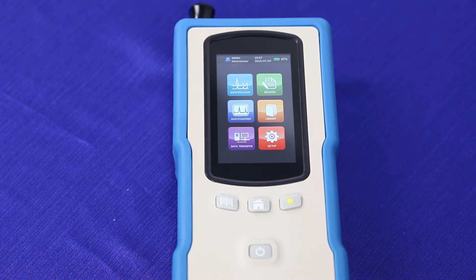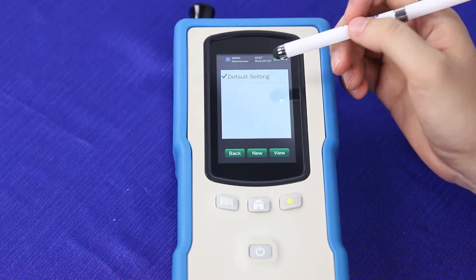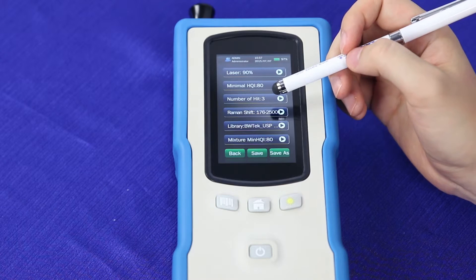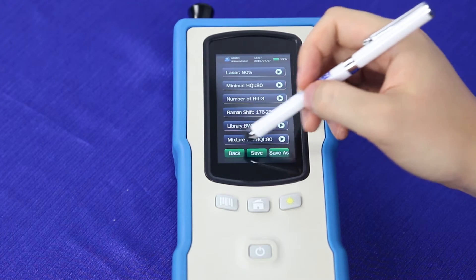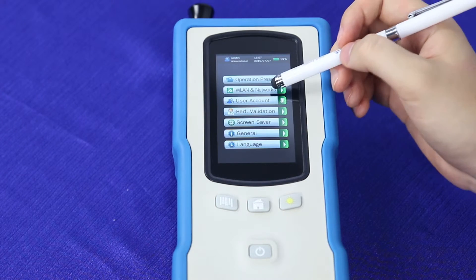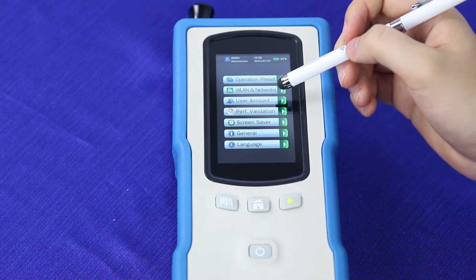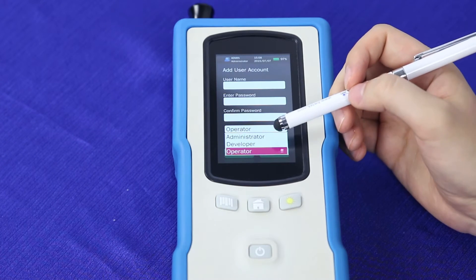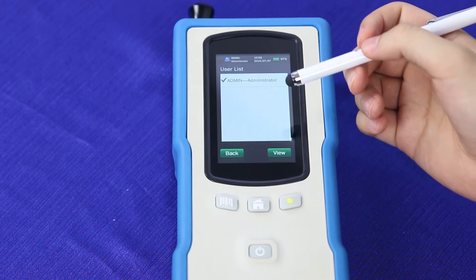Since you've logged in as an admin user, you'll have full access to all of the settings. You'll be able to change your operational presets, including laser power, minimal HQI, number of hits, Raman shift, which libraries you're using, and the Mixture HQI. You can also adjust which wireless or Ethernet networks the unit can access, add new user accounts at different levels — including admin, developer, or operator — and view current accounts.